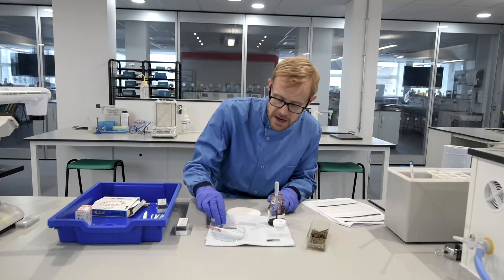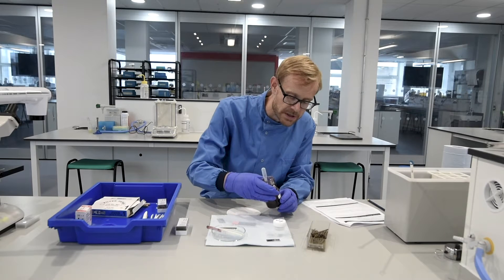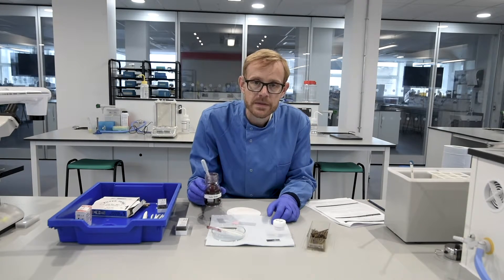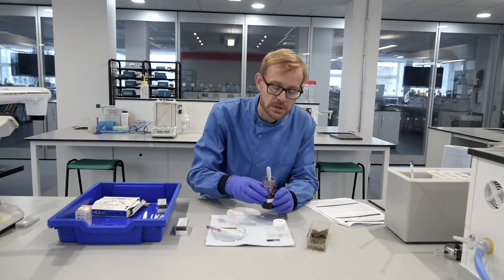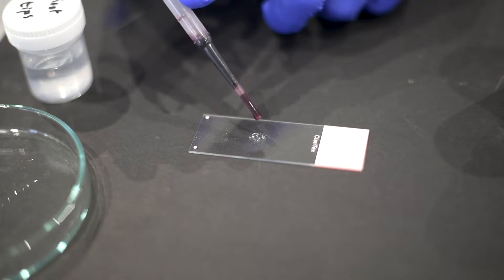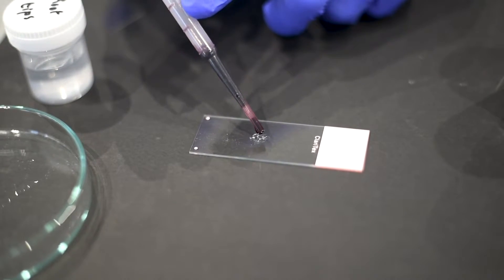We now need to stain that preparation. We're going to use this particular stain here, acetic orcein, and this is going to stain the chromosomes a dark orange to red colour using a single drop.